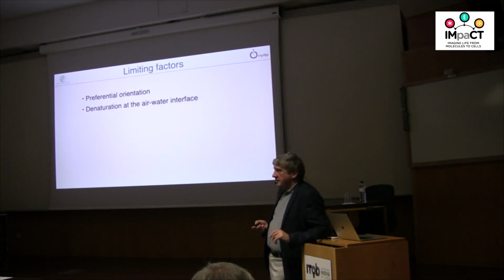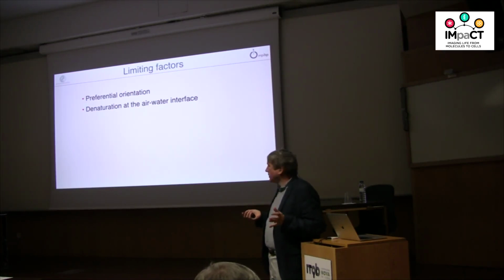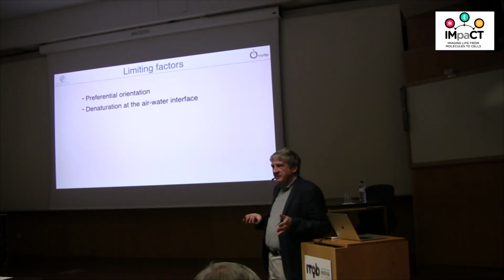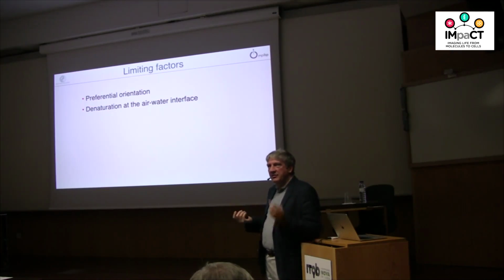Related to that is denaturation at the air-water interface. This could affect any sample, but it doesn't have to affect this one that I've just shown you. It affects lots of others. This is something we are working at, and other labs are working at, because the air-water interface is a very nasty place if you're a protein, because air is hydrophobic, water is hydrophilic. At the interface, we have these forces which tend to rip your protein apart. And if you have large, sensitive complexes, usually they are damaged or completely denatured at the air-water interface.